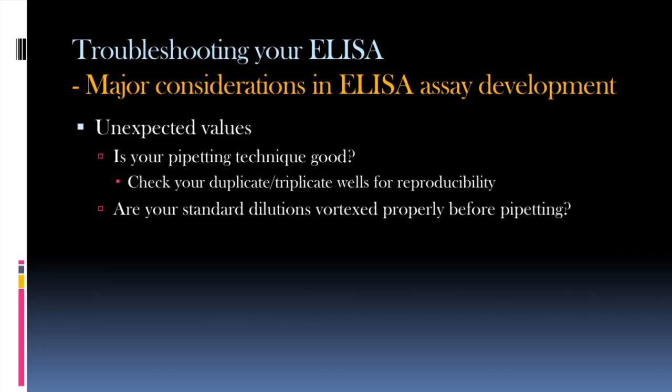Secondly, vortexing your solutions, not just your standard dilution, but also your samples, will need to be vortexed before you add them to the plate to make sure that everything is mixed in properly and you're getting the right concentration or the right amount of antigen in each pipette.